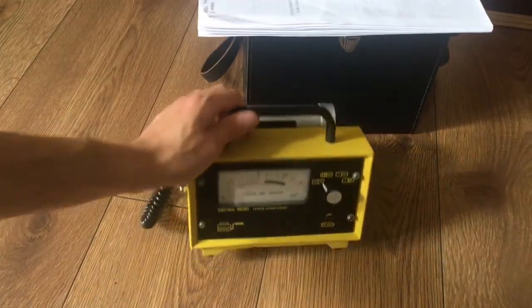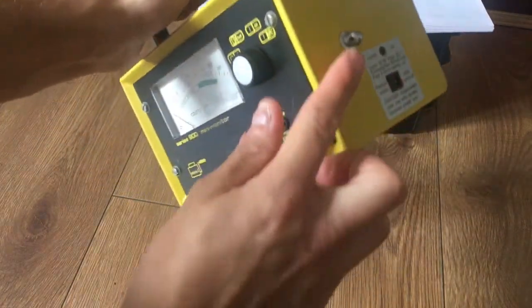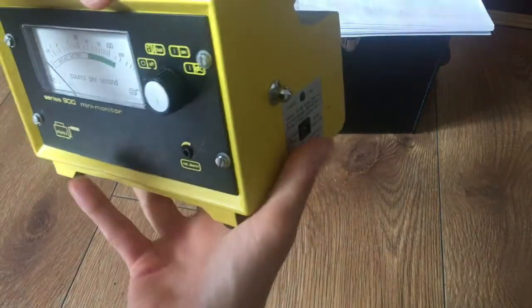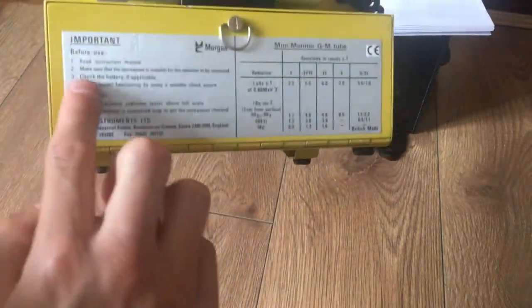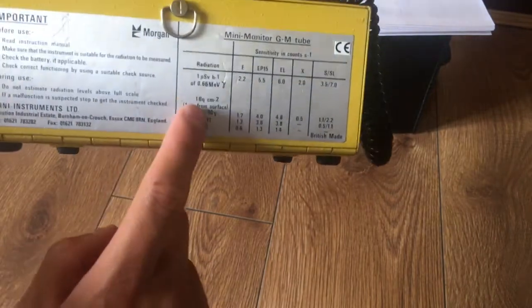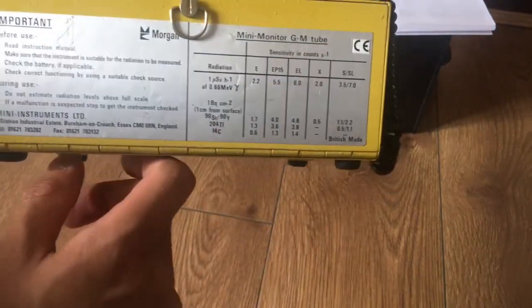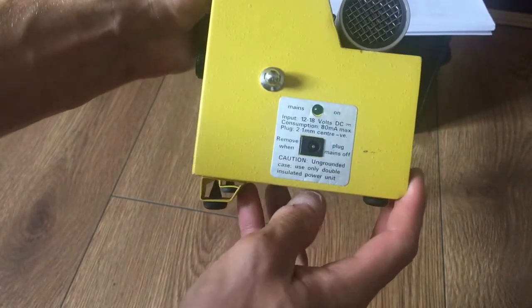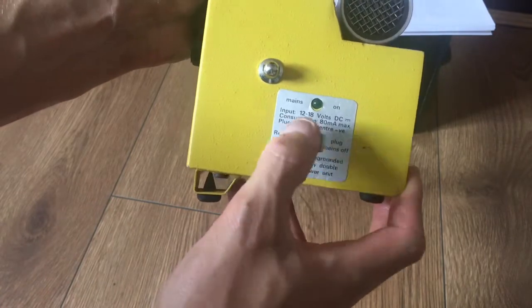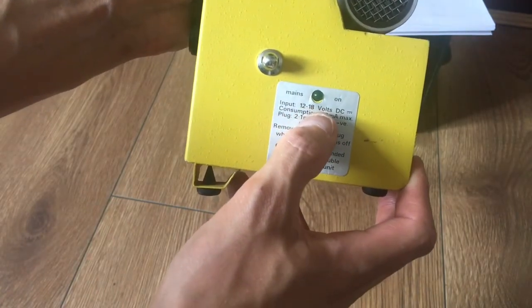If we closely look at the unit, you will see that it has straps here and here. It has information about before use and during use, the sensitivity of the GM tube, and a power adapter where you can power it without batteries using 12 to 18 volt DC.